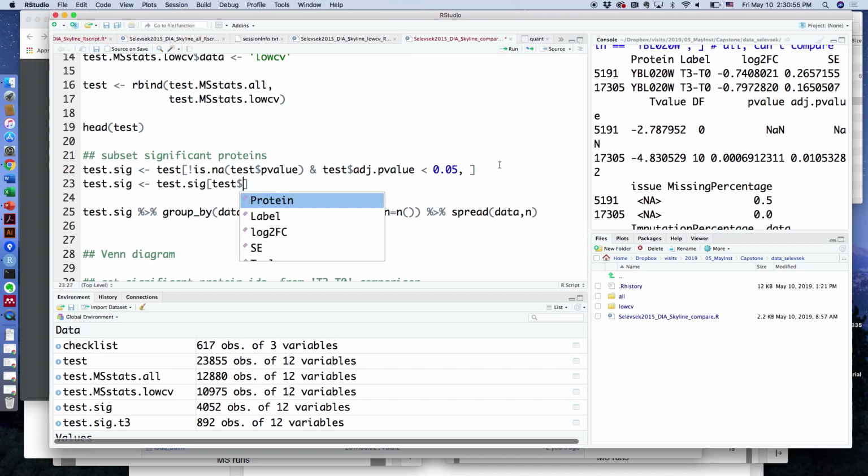we have this estimated log fold change, but this is a log scale. So up-regulated means plus, down-regulated means minus. Then they extract rows where this is positive. If this is negative, they are down-regulated. Or if you want both, this is the OR. Like this.